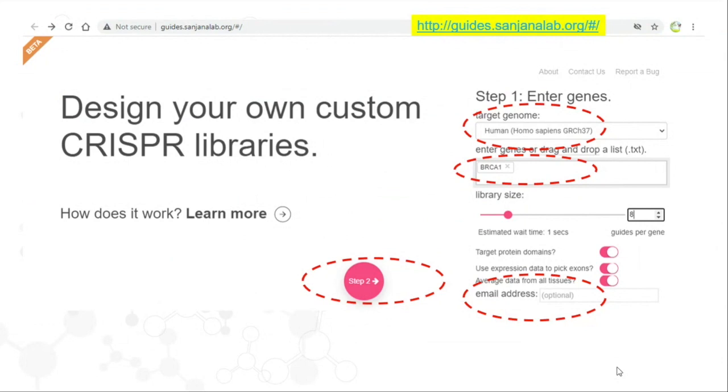So what I'm telling you is for designing purposes. You design on these portals and you order from anybody in India or any provider who is already supplying these things to your lab. So these are designing portals.